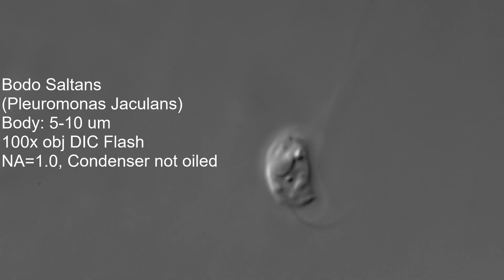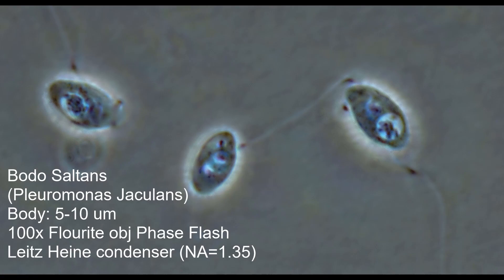I find that when you really want to drill down on tiny stuff, the fluorite objectives on the Leitz Diavert in phase contrast with the Heine condenser are just capable of producing so much detail. Here's a flash shot which luckily got three of them in focus at once with an NA of about 1.35, and the amount of tiny detail in there is pretty amazing.